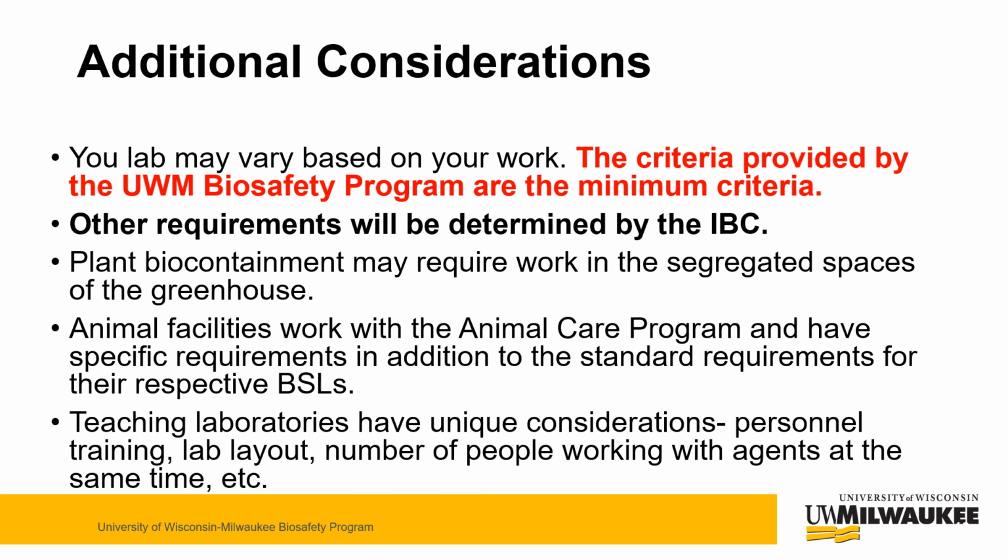Animal facilities work with the animal care program and have specific requirements in addition to the standard requirements for the respective biosafety levels. Teaching laboratories have unique considerations: personnel training, lab layout, the number of people working with agents at the same time, etc.